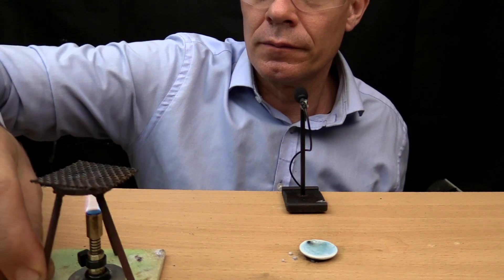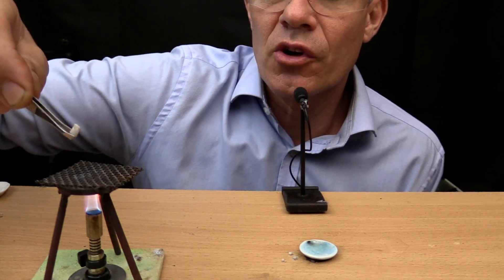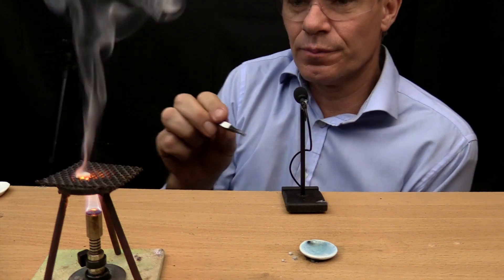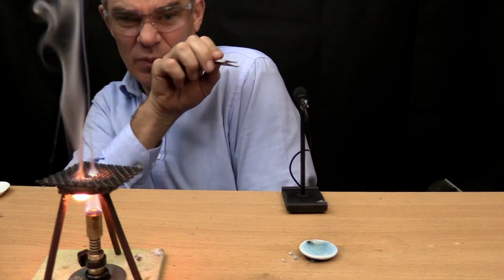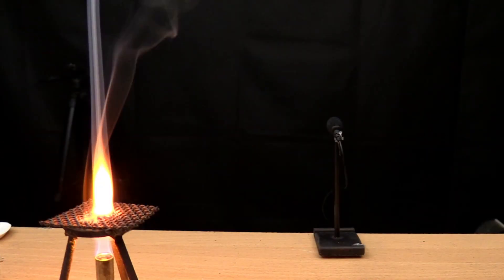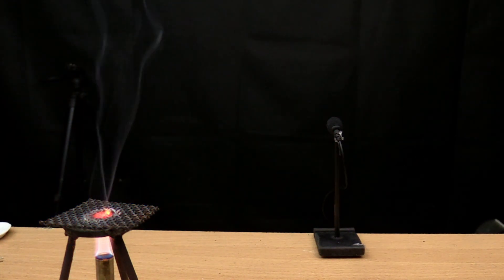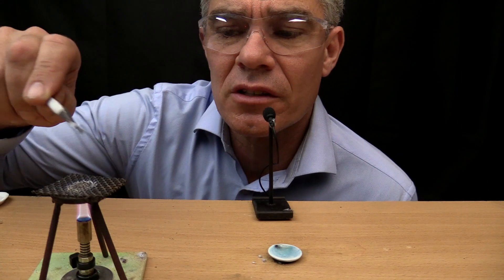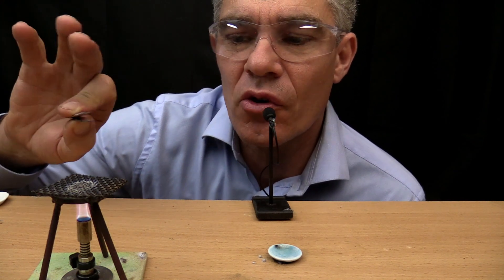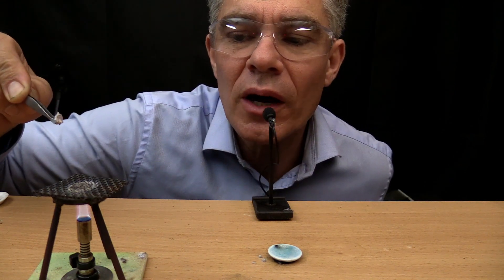Wow. Here's a little piece of sodium. I'm going to put it in the heat and see what happens. It melts. Wow. Did you notice that it burnt with a very yellow flame? That is very characteristic of sodium. A test for sodium is that it burns with a yellow flame.